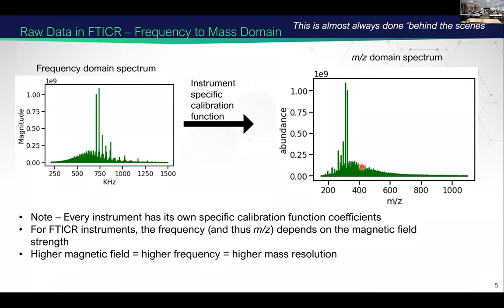So you said you identified about 10,000 peaks per sample using the instruments. Yeah. Okay. I'm wondering what percentage of the peaks can be assigned a formula. Right. So it obviously varies a little bit. What we typically aim for is somewhere in the range of 50 to 70%.